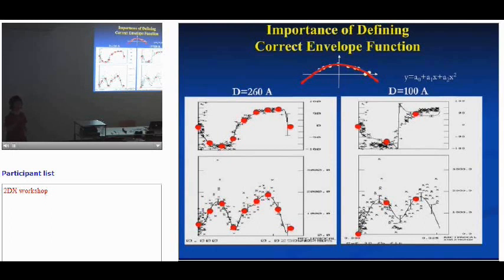When you have a small envelope, in your reciprocal space, your sinc function becomes wider. So overall the curves that you obtain will be smoother, right? This obviously has more movement than that function will be able to describe. So it's very obvious 100 is not going to work.